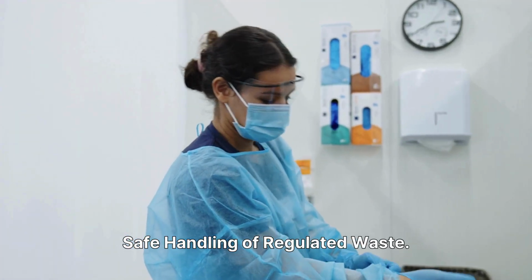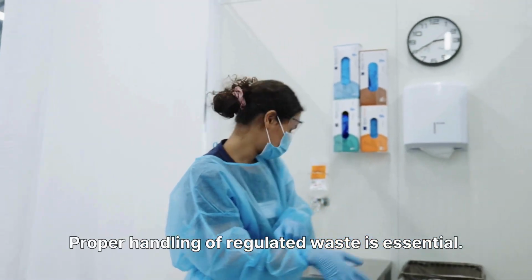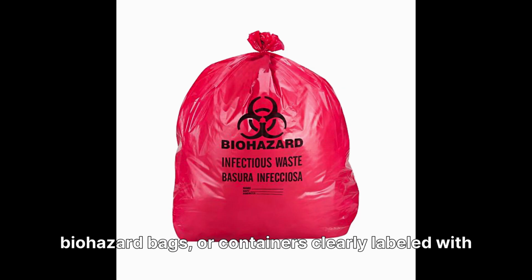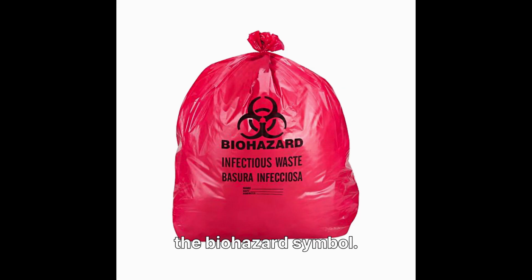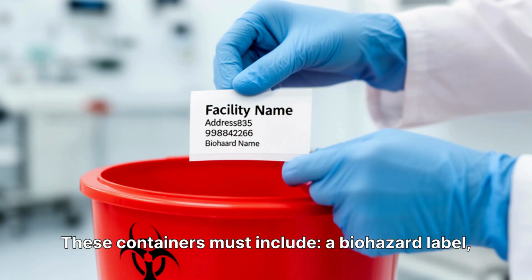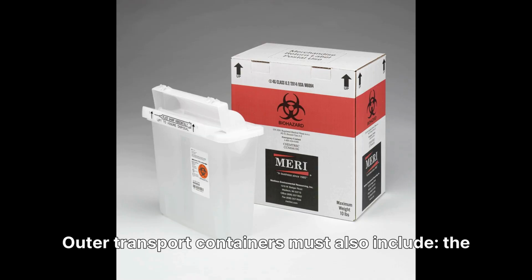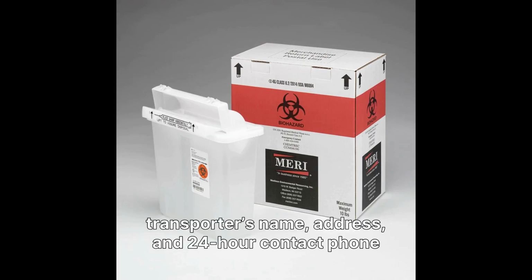Safe handling of regulated waste. Proper handling of regulated waste is essential. Regulated waste must be placed in red biohazard bags or containers clearly labeled with the biohazard symbol. These containers must include a biohazard label and the facility's name and address. Outer transport containers must also include the transporter's name, address, and 24-hour contact phone number.